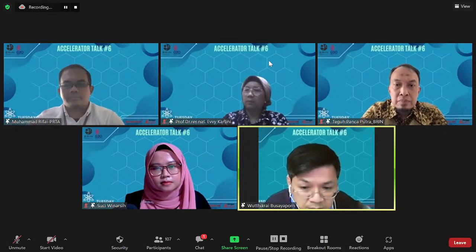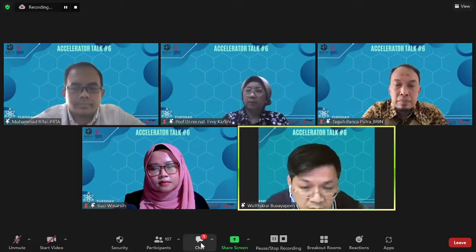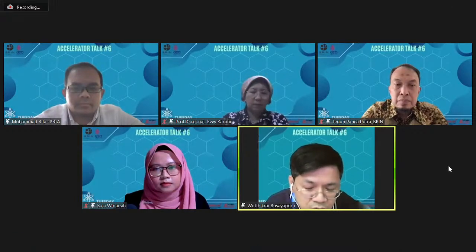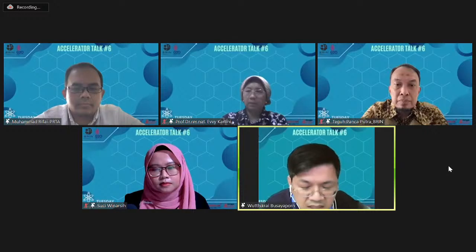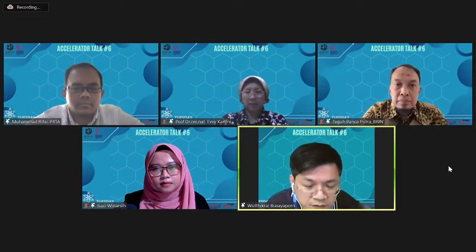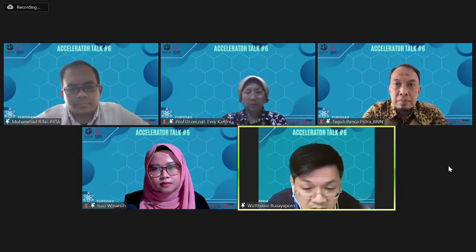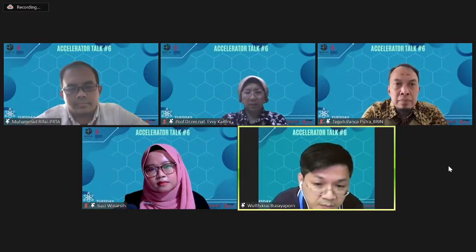X-ray diffraction is another one, which is very popular. Everyone uses it. Most research institutes have an XRD machine, but to use synchrotron radiation XRD, you get better energy resolution and can look deeper inside the structures. We have one here. So it depends on the users, which design or direct us to build up the technique to match them.